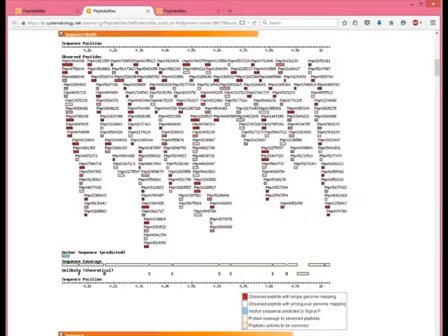So the darker ones have been seen more. And so what you'll see is you have these nested sets, and basically what this means is a lot of these are semi-tryptic or have missed cleavages in them. But typically the ones that you see the most are fully tryptic.